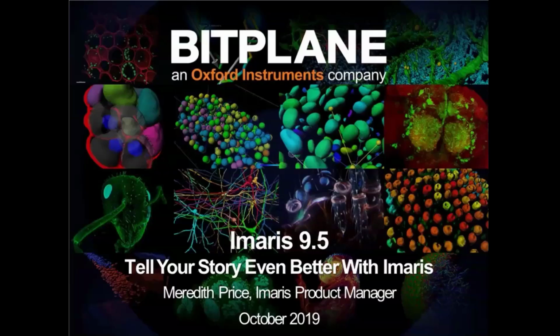So Ben is asking if the MATLAB distance transformation extension will still be available through the XT module. And it will. There are other applications that this measurement isn't able to address, and I'm guessing Ben realizes this.